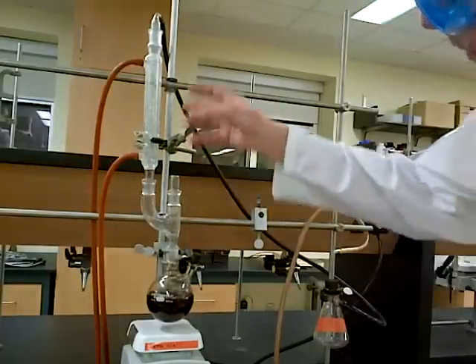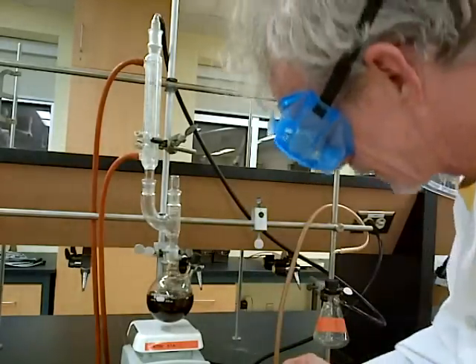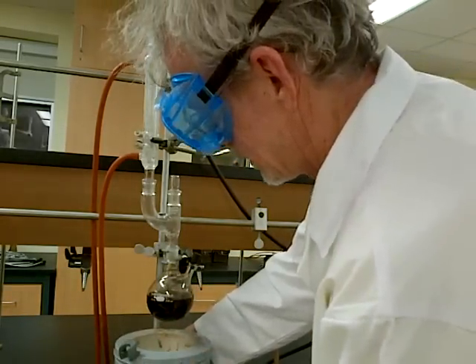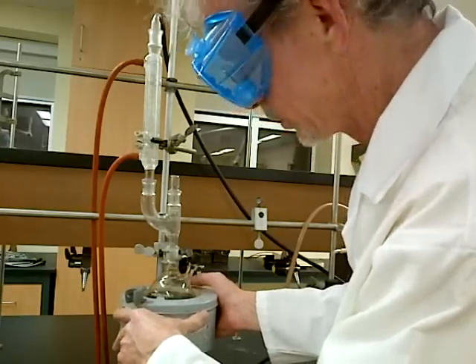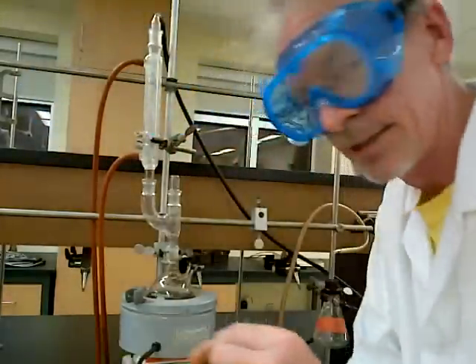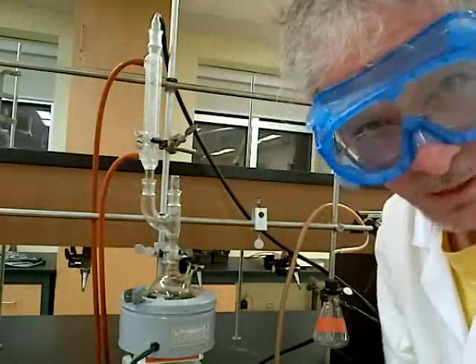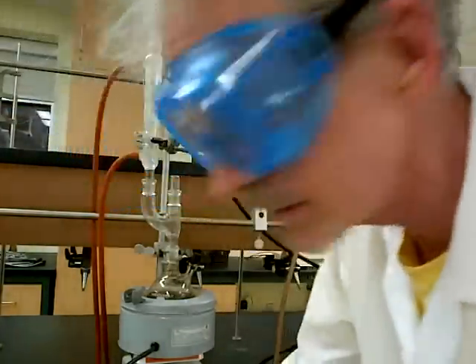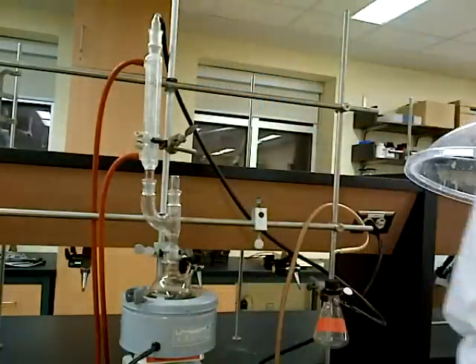Our addition is now finished. I have removed the separatory funnel, placed the stopper, cleaned it up and put it away. Now we have to carefully lower our stir plate, put the heating mantle in place, and gently raise it up until it is just barely touching. Plugging the heating mantle into the power supply, which is plugged into the wall. Setting our temperature — approximately 60% on the 0 to 100 scale — and now we sit back, wait, and heat a little more.